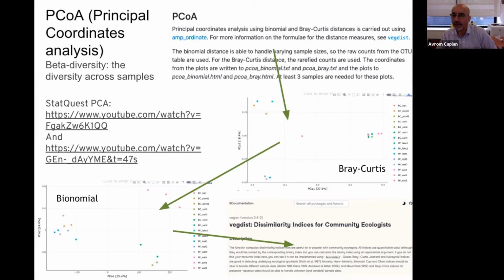Karen asks, will it make one for each column in the metadata file, like for alpha diversity? No, so it's not in these plots that come out of the DADA2 pipeline. You're limited to how they're grouping them by pond or soil and so forth.